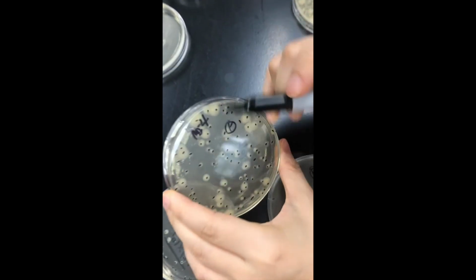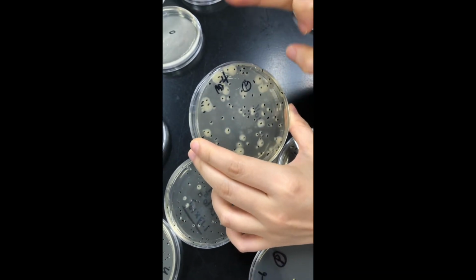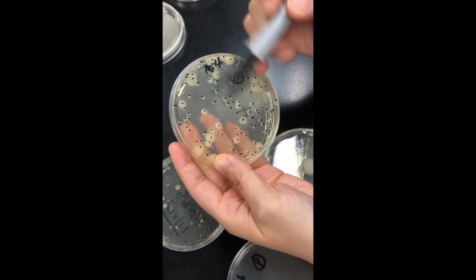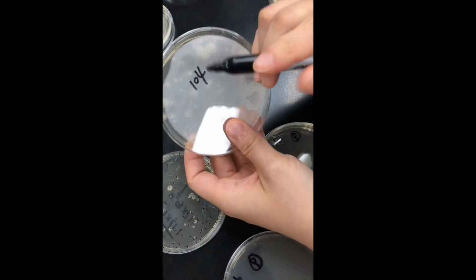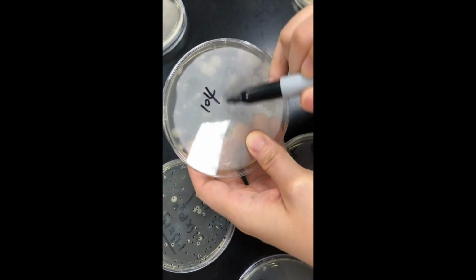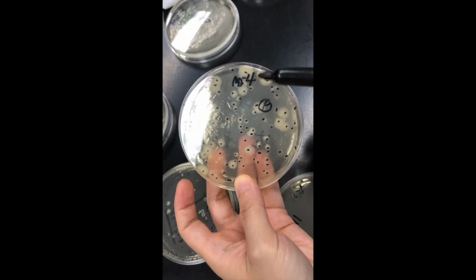So this is our 10 to the minus 4 plate from our pasteurized raw milk sample, and we finish counting the cells by marking a dot at the bottom part of the agar plate. We have 104 colonies present on our 10 to the minus 4 plate.